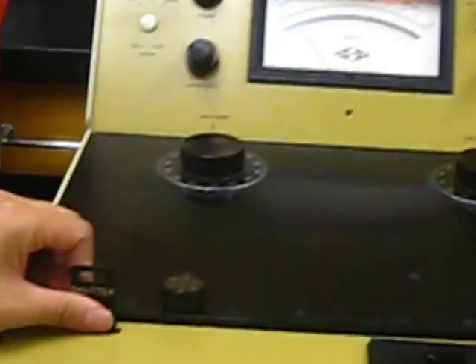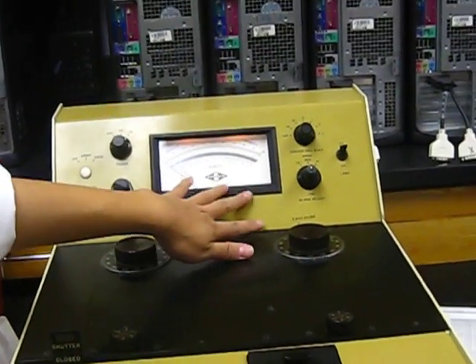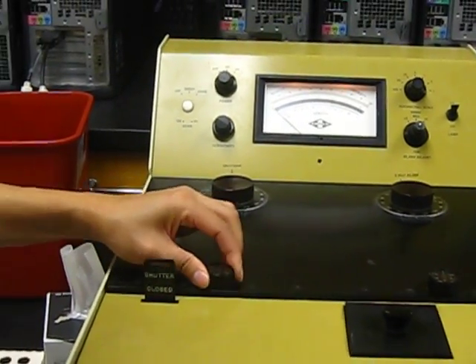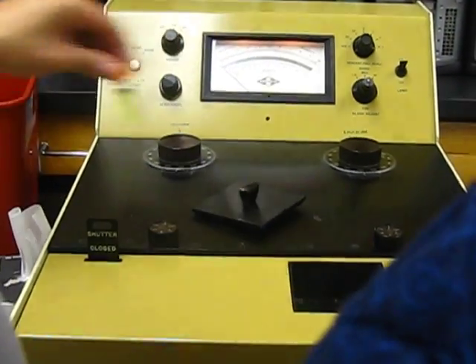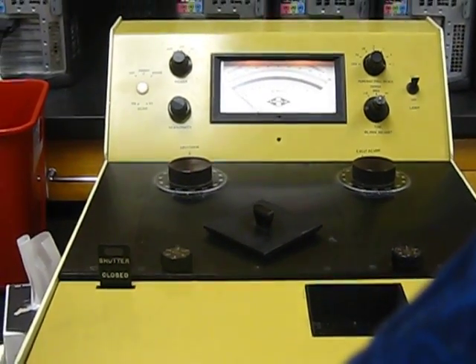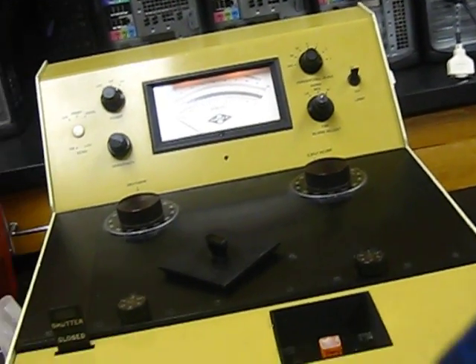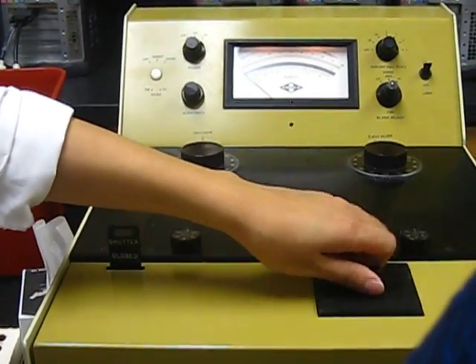So we close the shutter and put the excitation slit to 1 millimeter and the emission slit to 0.5 millimeter, and change our sample to blank. Yeah, because before the measurement we will set up this. Why did we change the slit back to 1? This is on your lab note. Lab note. Okay. Close the lid.